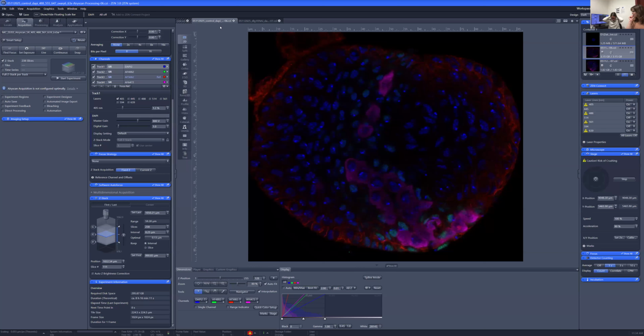We got a really nice introduction yesterday into all of the different steps that go into this immunofluorescence protocol. And today we're actually going to be able to see what this imaging actually looks like in real life.